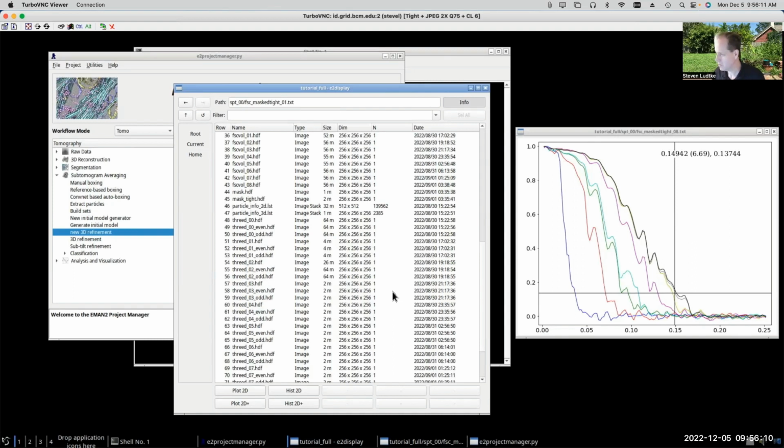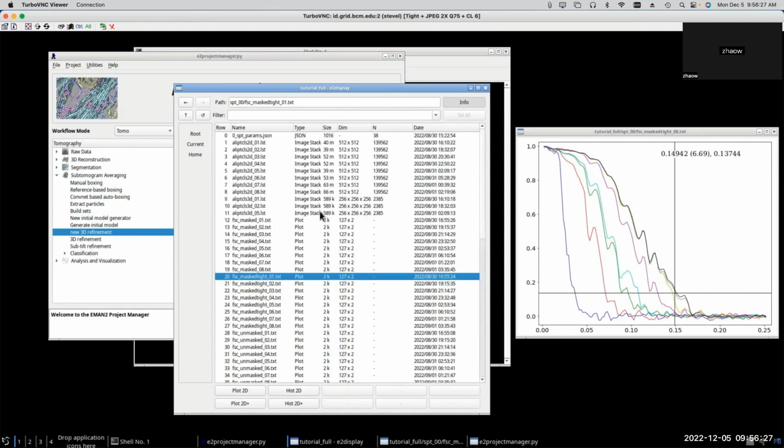So is it possible we could know how much of the particle orientation has changed during this iteration by iteration process? You could keep doing 3D and 2D alignment for more iterations. How could we tell when it's approaching a converged state, so that you don't need to continue the refinement?